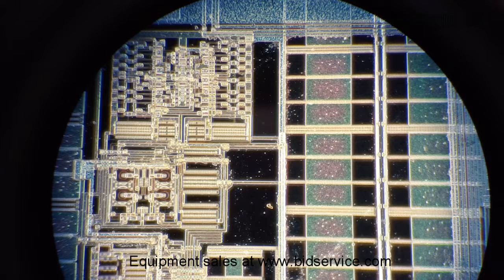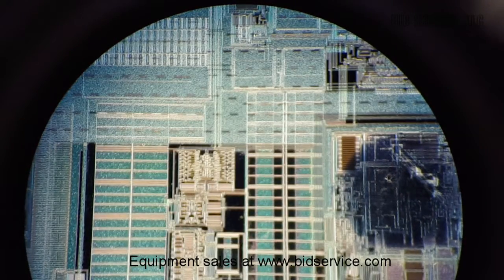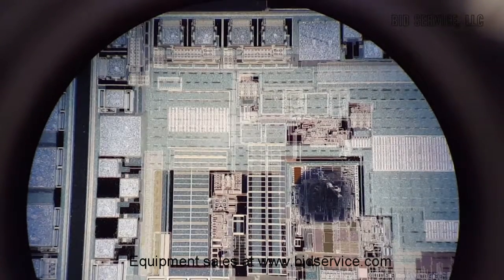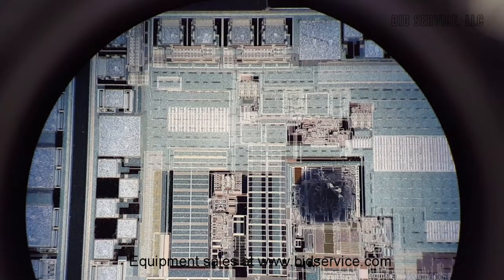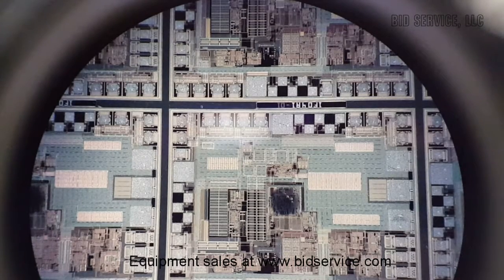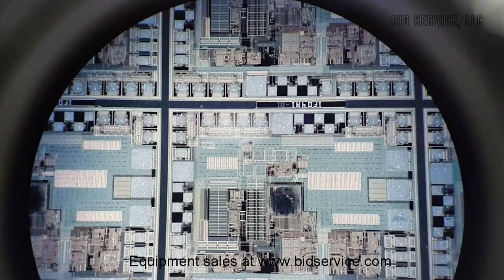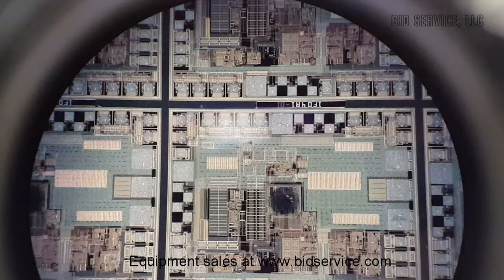I've set the camera up to the eyepiece. This is dark field at 50x, then 20x, 10x, and 5x. Usually on dark field you have the brightness turned all the way up, or close to it.